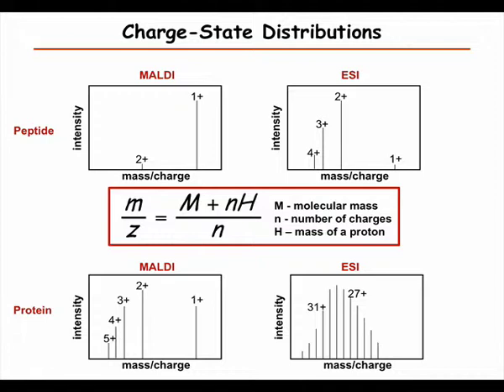Yeah. You said you divide by the charge, or you divide by the number of charges? Number of charges. Yeah. Sorry. Yes. Number of charges. So n is the number of charges.